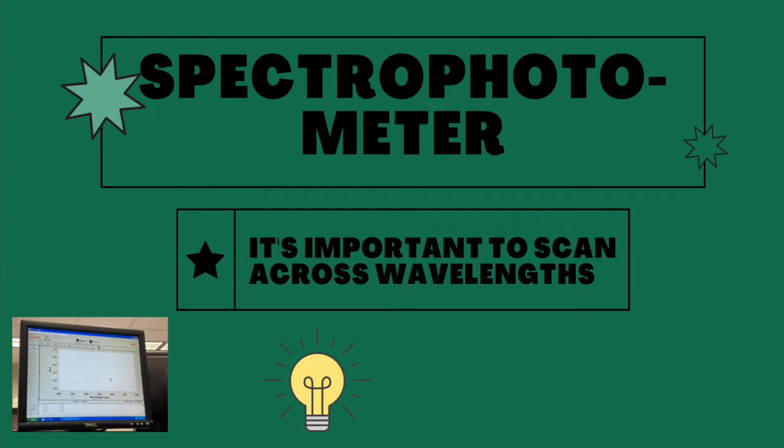Speaking of wavelength, for any stock or original solution, it is important to scan across all wavelengths using the scan program in order to find the optimal wavelength, or the highest peak in the graph as seen in the bottom left for a substance, which is where the best absorbency of light can take place. Also, scanning across all wavelengths will help you find the optimal wavelength, which will also minimize the relative error of the measurement because you know that the data is as accurate as it can be for that particular sample.